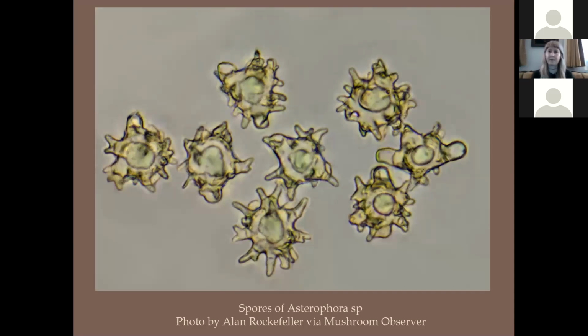Okay, and then some of them have just wild shapes. This one's kind of star-shaped, so Asterophora is the genus for this, and I think that means star-bearing. So this mushroom is bearing little stars.